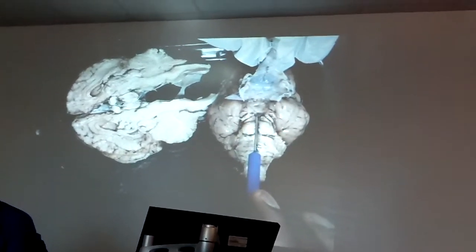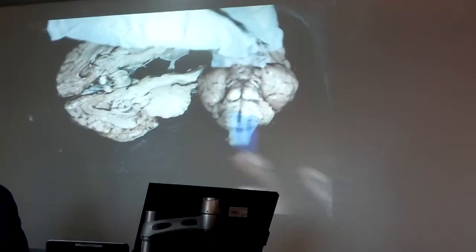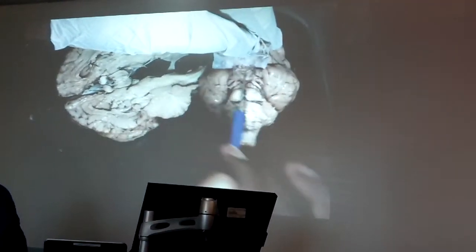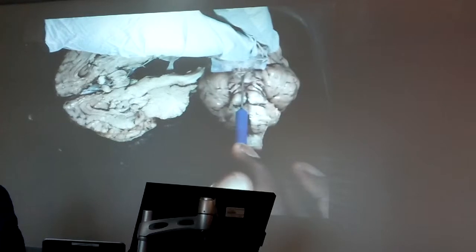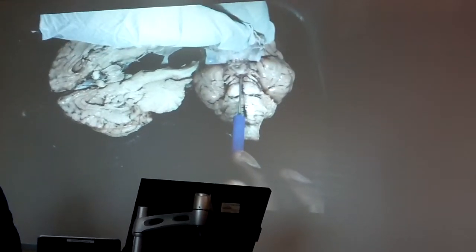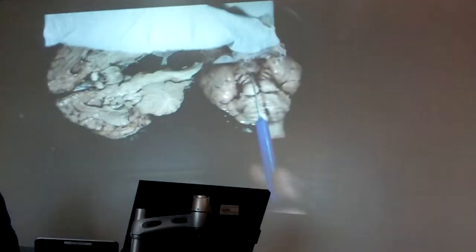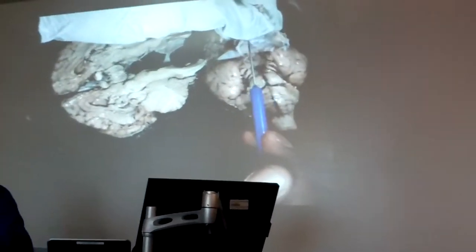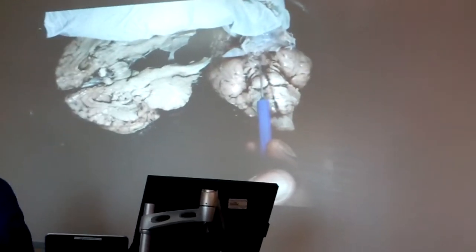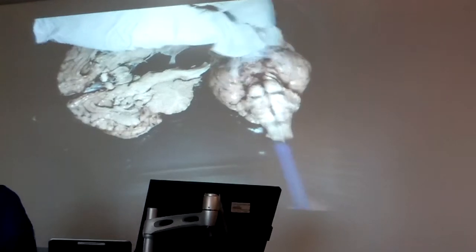I'm touching it now. What hole? You see this little hole right here? Okay, yes. There's a hole right here. His name is infundibulum. Right below it is this cute structure right here called the mammillary body. The only way you can see this, you've got to pull up the pituitary that's found inside of all this tough sheath, which is known as the dura mater. That's the only way to see this. And that's where you see all these bumps and stuff.